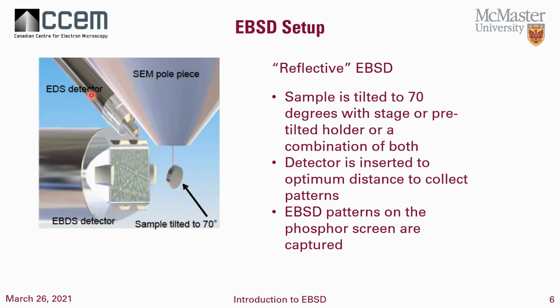We can also use EDS, so energy dispersive spectroscopy of X-rays, to also collect X-ray information from the sample at the same time, which can be useful, especially when you're sometimes trying to identify an unknown phase.